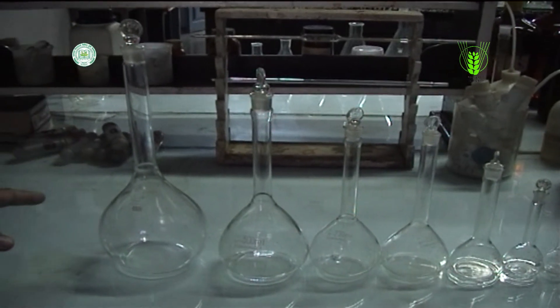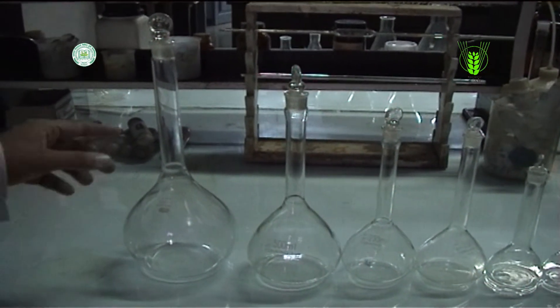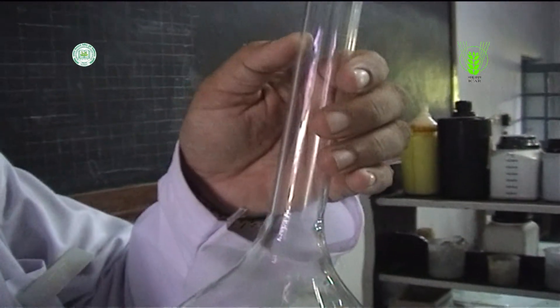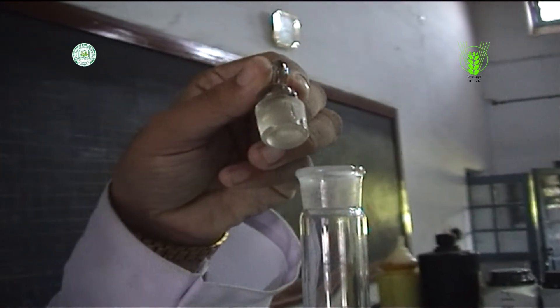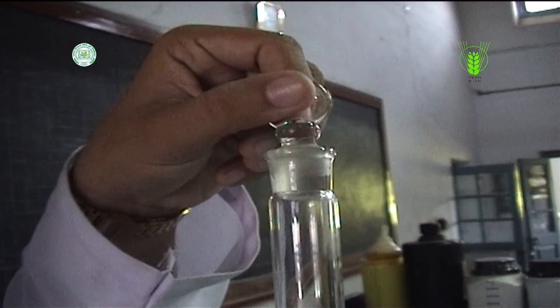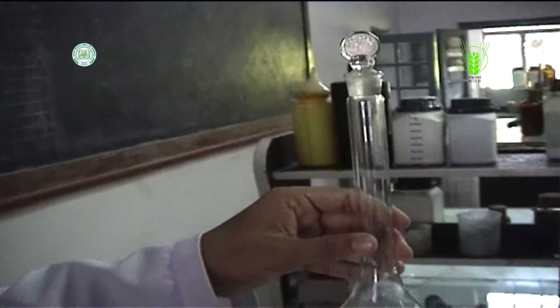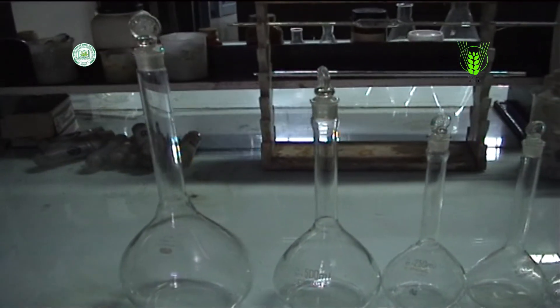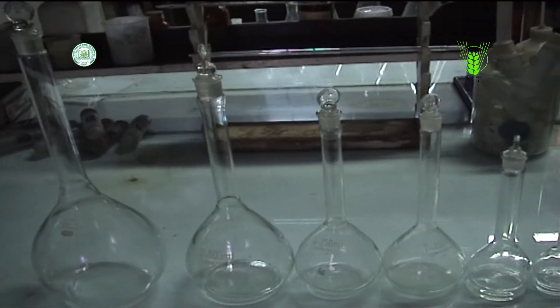It is calibrated to contain a precise volume at a particular temperature. Volumetric flasks are used for precise dilution and preparation of standard solutions. It has a mark ring upon which we have to fill the flask. It has a stopper too. These are of variable capacity from 5 ml to 2 liter.